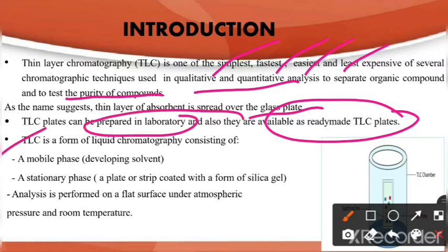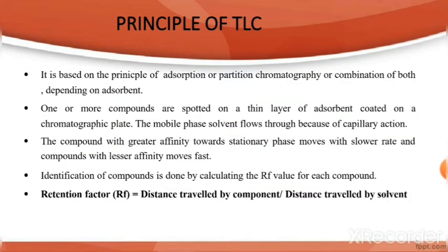The TLC is a form of liquid chromatography which consists of a mobile phase, which is nothing but the solvent, and the stationary phase, which is nothing but the TLC plate with silica gel. And the analysis is performed on a flat surface under atmospheric pressure and room temperature.